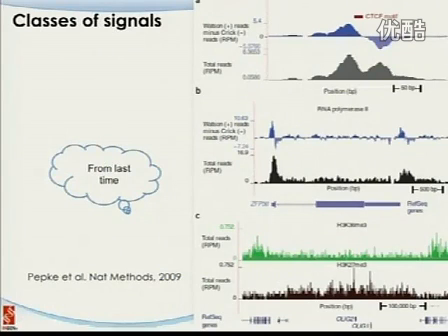And the second major point is, when we talk about ChIP-seq, we always think of transcription factor binding sites. If that's the transcription factor binding sites, the signal distribution will look more like the first one. You can see there's a cluster in the positive strand and in the negative strand, and they are kind of shifted. We will have the next slide to talk about why that happens.